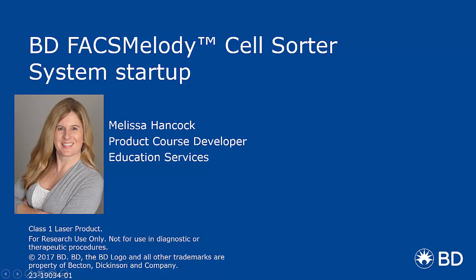Hi, my name is Melissa Hancock. Welcome to the BD FACSMelody Cell Sorter System Startup Tutorial. This tutorial will cover how to perform a fluidic startup, insert the sort nozzle, and run a cytometer setup with drop delay.